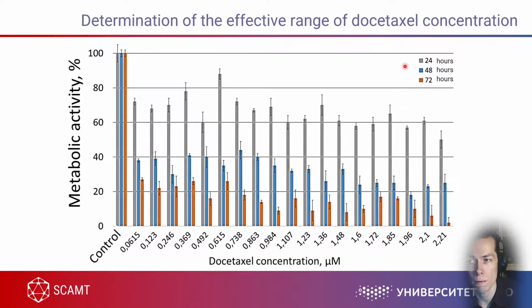So only after 48 hours, as you see, like a step here, step, cell division, cell division, cell division. Because cells enter this cell division in batches, they are dying, like 20%.